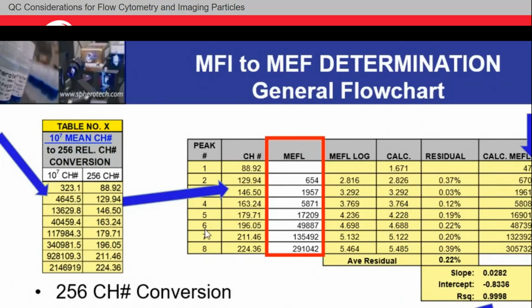Now, all of these settings have to be the same. We have to hold voltage, right? We need to hold, of course, channel, right? We're going to be holding all the same settings and running them with our calibration particles, then with our unknown population A. Typically, you also have this as a known. You want at least one known before you walk up to your flow cytometer. So maybe you have a fluorimeter, maybe you have one known, one unknown.